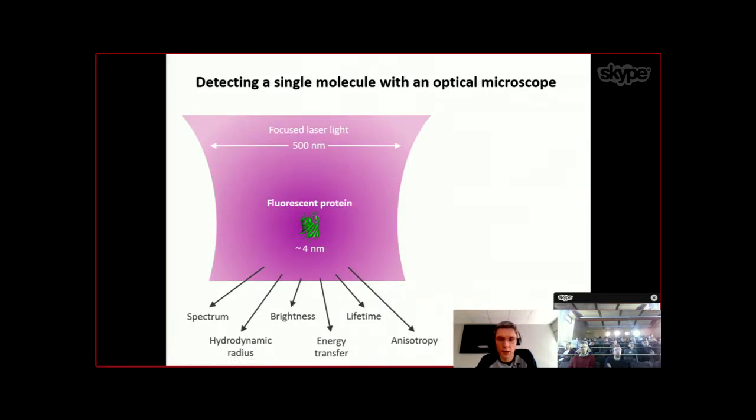This is not relevant to your microscope objective. You take the best objective, best Nikon objective, whatever brand you want. As long as you work with classical conventional optics, diffraction is going to occur. You can play a few tricks, but this diameter is always going to be a few hundred nanometers, which means it's going to be 100 times bigger than your object.